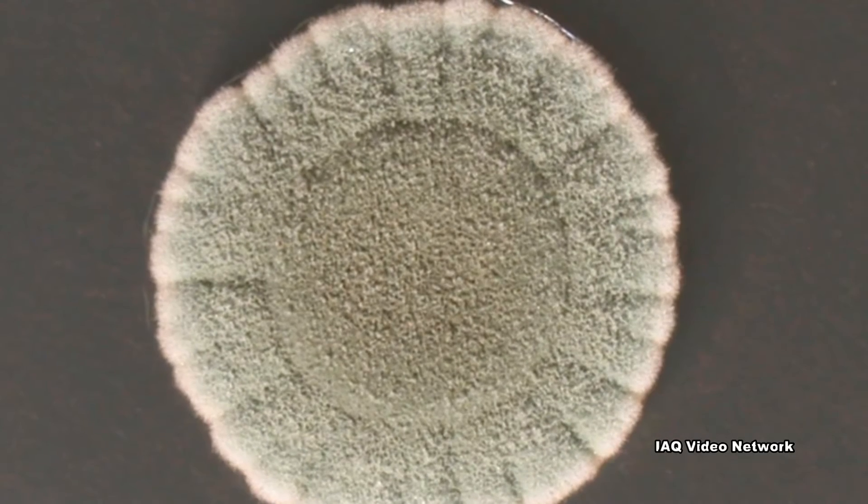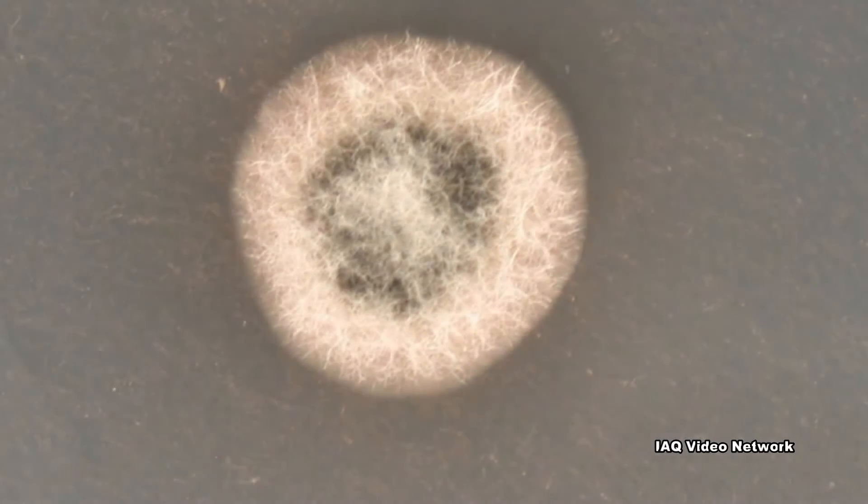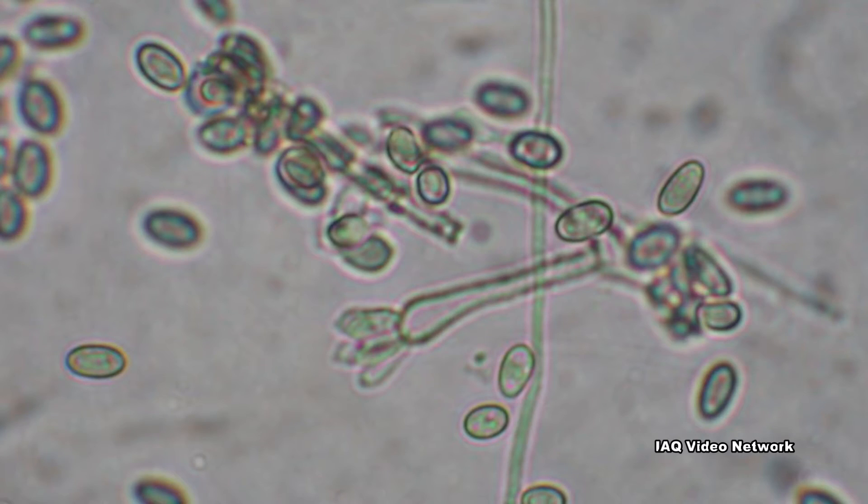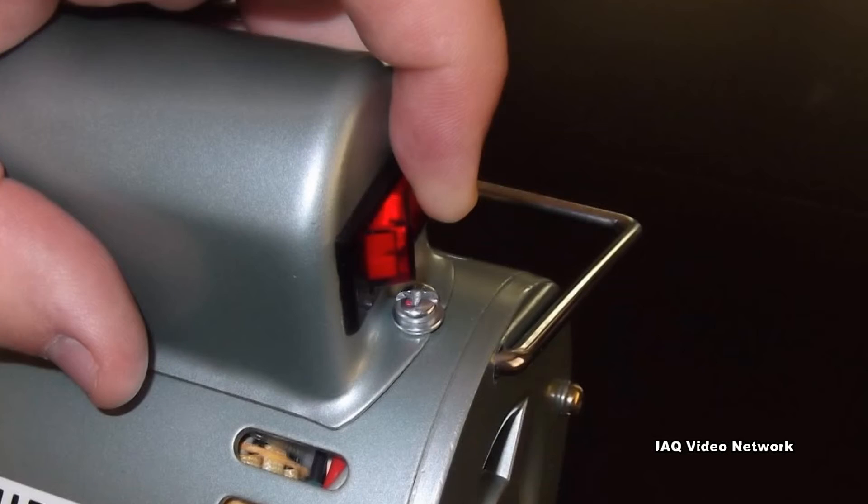No air flow measurements. Most industry standards and guidelines report airborne mold samples as colony forming units per cubic meter of air, but determining the level of mold per volume of air is impossible without controlled air flow through the use of a mechanical pump.